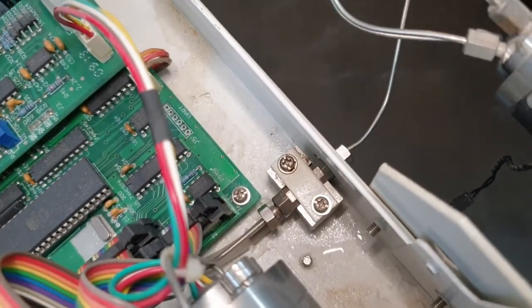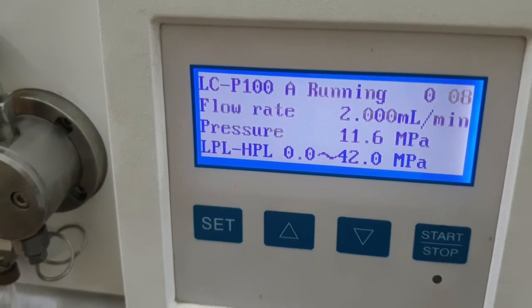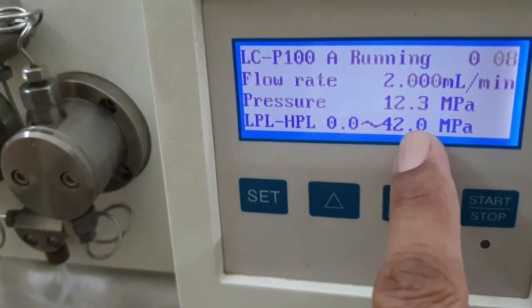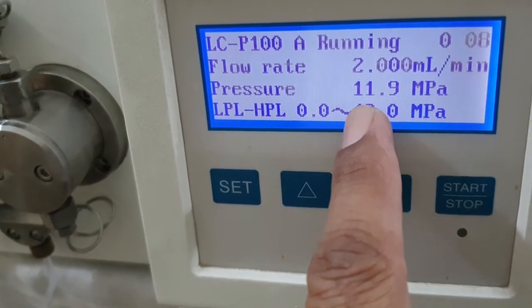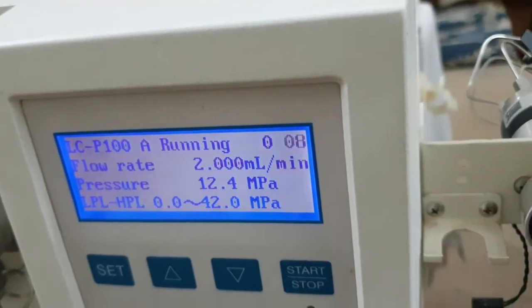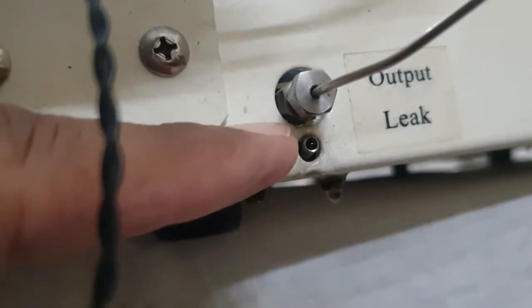Now we will rectify this problem. The flow rate is set at 2 ml per minute and the pump is in running mode. The back pressure is 11.9 MPa, but the limit is 0 to 42 MPa. It should be more than 12 — because of the leakage somewhere inside the pump, the pressure is low. We can see the drain point and check if there is any leakage from that part.